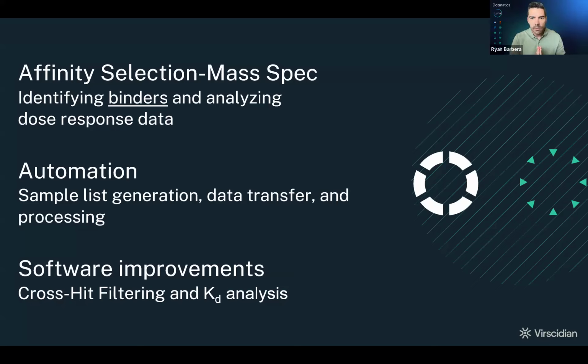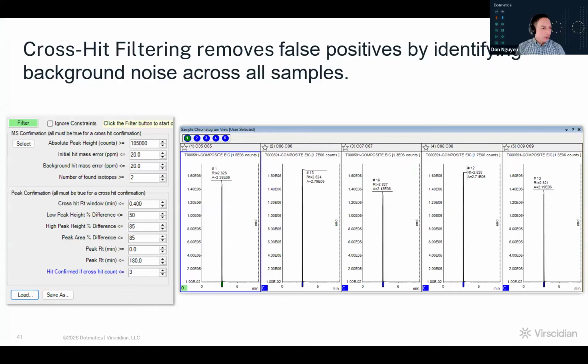How do you define a recurring background signal and can I adjust it? Right. So let me just jump back a few slides here because we can. We control what's considered a background signal based off of our filtering settings. So yes, this is all user definable and user editable.